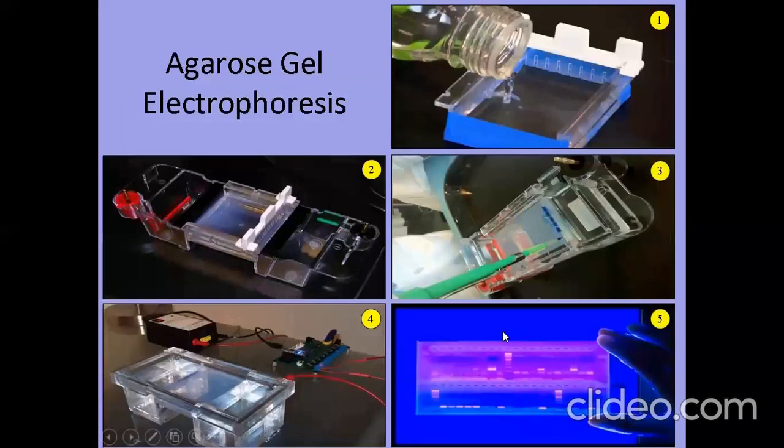And after this, this is gel electrophoresis. This is the actual gel electrophoresis, how it is done. This is the liquid gel, and it has a temperature above 40. It could be 50 or 55, and ethidium bromide has been added to this gel. It could also be post casting, done after electrophoresis, where at this stage it could be stained. So ethidium bromide, everything is added, and it could be poured into the casting tray.